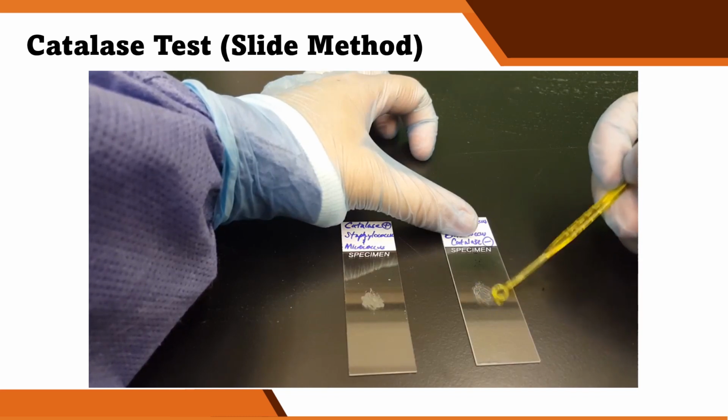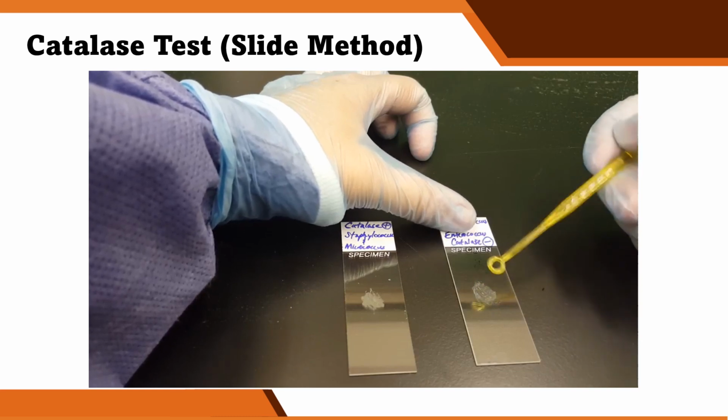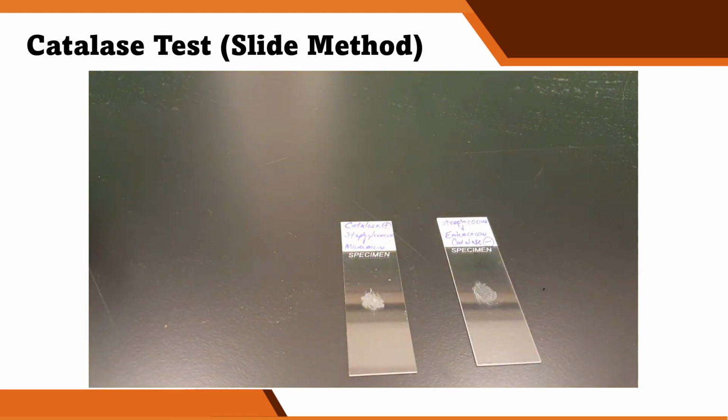But in the first grouping, we have the gram-positive cocci, gram-negative cocci, and gram-negative cocobacilli. So that would be Staphylococcus, Micrococcus, Enterococcus, and Streptococcus are all gram-positive cocci.